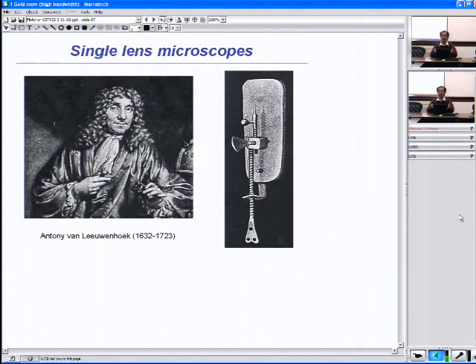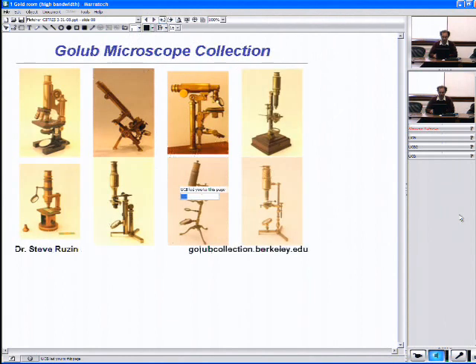So this is really a prototype for what we would like to have. We would like to have something that they already had in the 1600s. That is something that was easily portable, that could provide high resolution. But what they didn't have, of course, is the ability to transmit that any distance. So again, sketches were the way of the past, and now we have the ability to capture on CMOS or CCD sensors and then transmit those images over long distances.